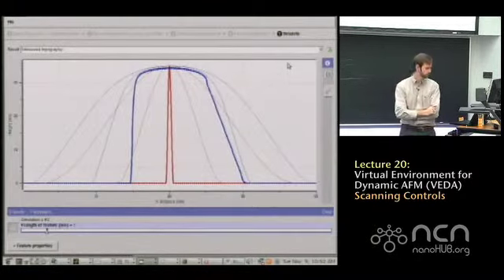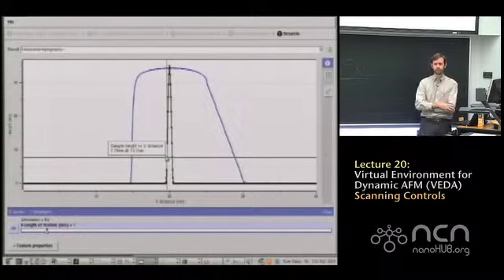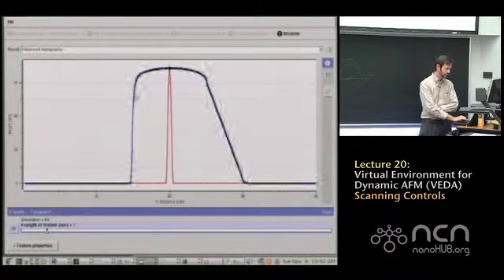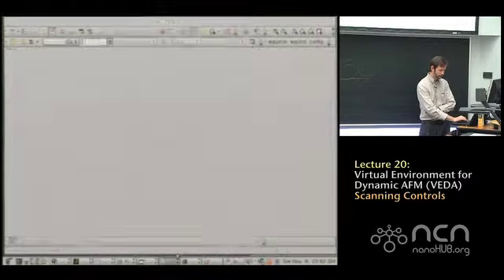So now this is quite interesting, right? I have this feature, which is just a little spike. But what I actually get is this huge, huge looking thing. And now it's not quite obvious because the aspect ratio of my screen's a little off.